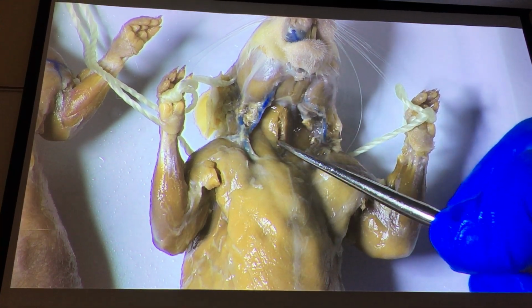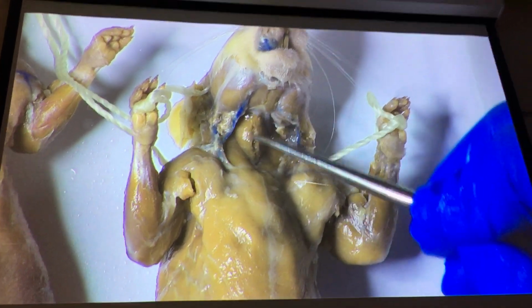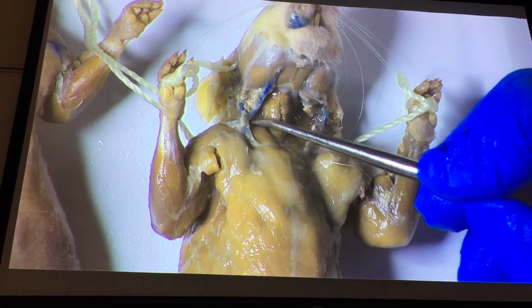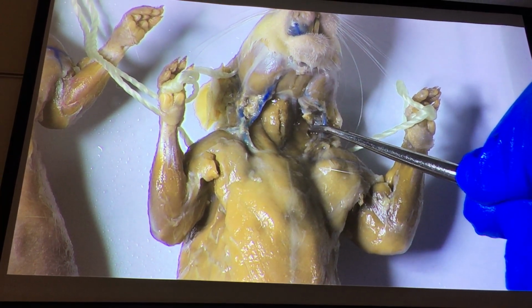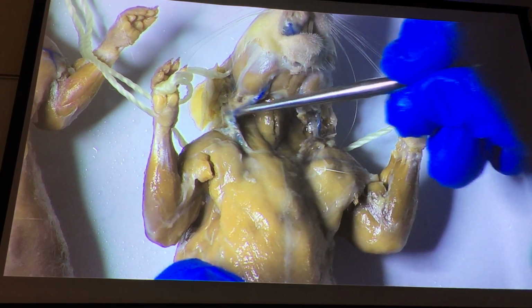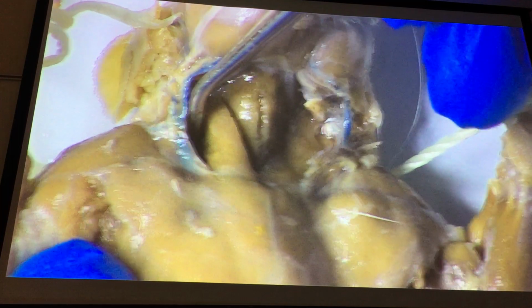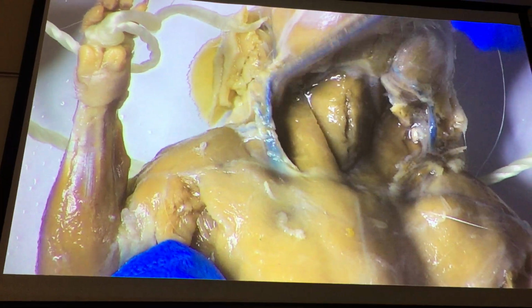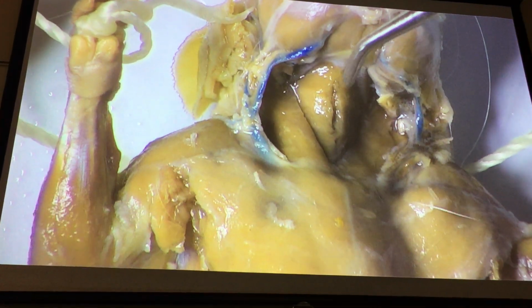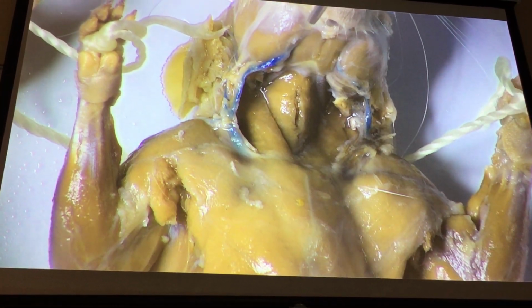And then here, we have a muscle you want me to ask origin and insertion on, right? Sternohyoid. From the manubrium to the hyoid, and I would take from sternum to hyoid. On the side here, sternomastoid, right? Again, origin, insertion, you want those for neck muscles, right? And then the one that's a little hard to see, and I might have to dissect that out a little bit when it's time, but right behind it here, we have our clavotrapezius, right there, under the external jugular, okay? So, I am not above doing a little dissecting when I'm setting up your exam to clean up borders and all that to make things look a little easier for you.